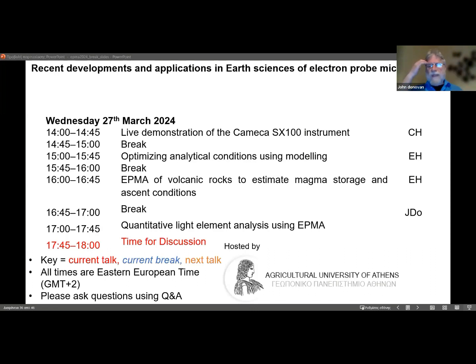Now, if you're doing just trace elements, it wouldn't really matter if you had 4 spectrometers and you're getting 100 ppm in each spectrometer. As I pointed out in my talk yesterday, the matrix correction is a very minor effect at the trace level. So as long as the matrix is SiO2, it really doesn't matter if you measure titanium on 1, 2, 3, 4, 5 spectrometers, but you will improve sensitivity when you aggregate them also.